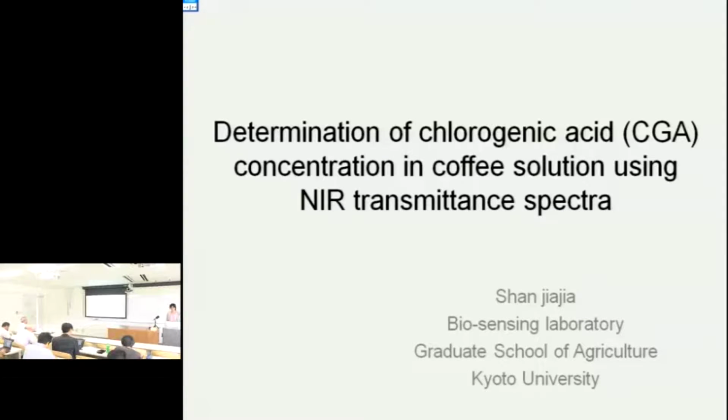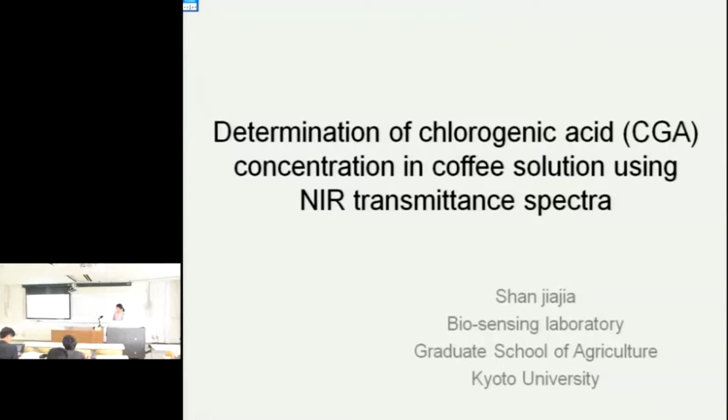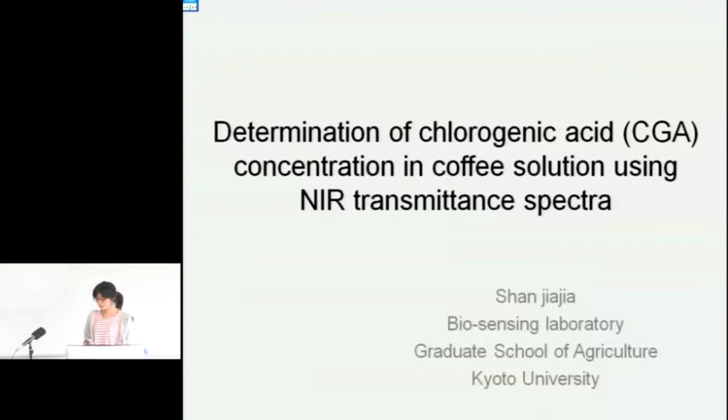Good morning, everyone. Today I will introduce my research: determination of chlorogenic acid concentration in coffee solution using NIR transmittance spectrum.